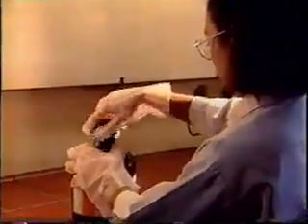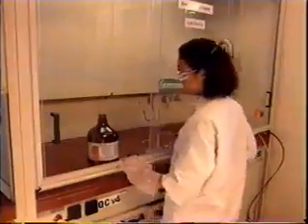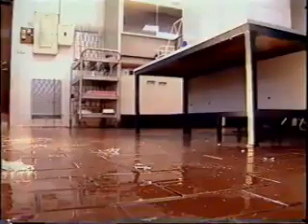Experiments that may produce hazardous gases have to be carried out in a fume cupboard. Make sure that the hood is closed properly. Ensure that the hood is functioning properly. Spills of chemicals on the bench or the floor have to be cleaned up immediately to avoid accidental contact with the skin.